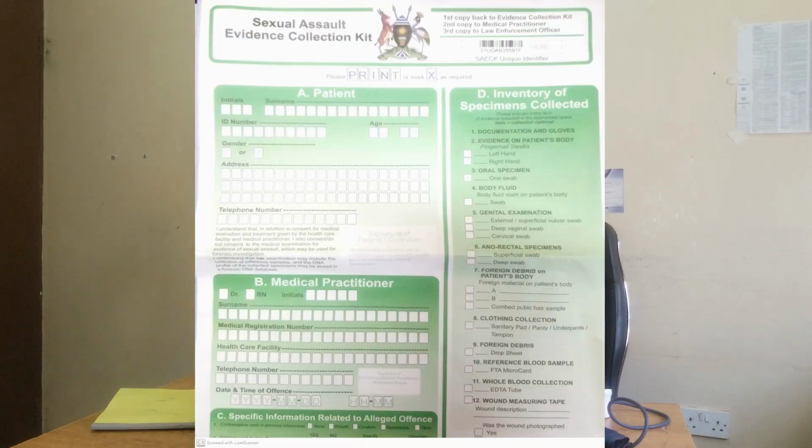The instruction guide comes like this. It comes with three carbonated papers inside. One copy will remain with you after filling it, another one you put back in the box or kit, then another one you send to the police or a legal place.